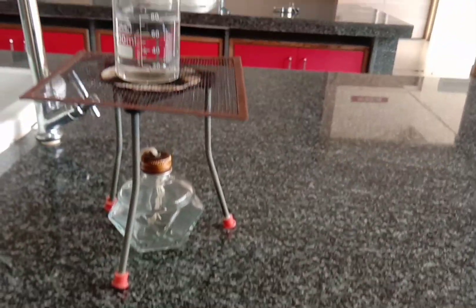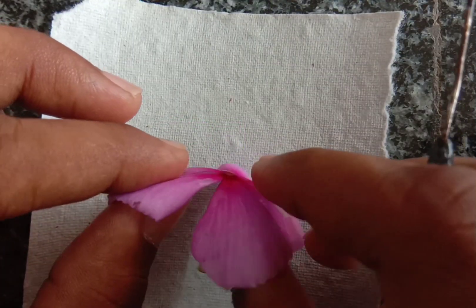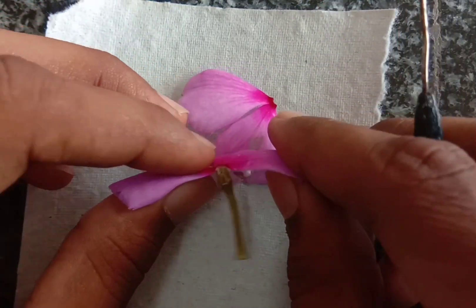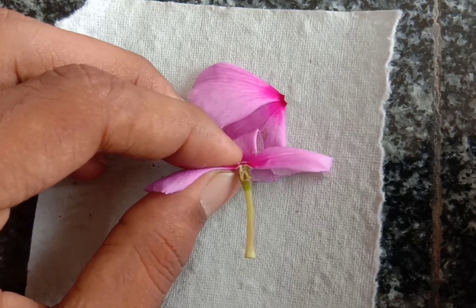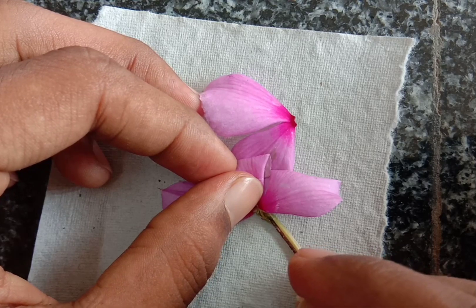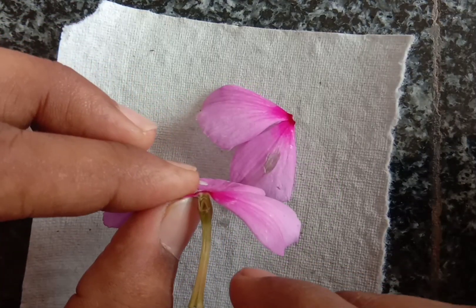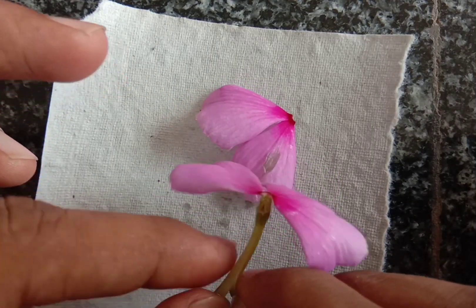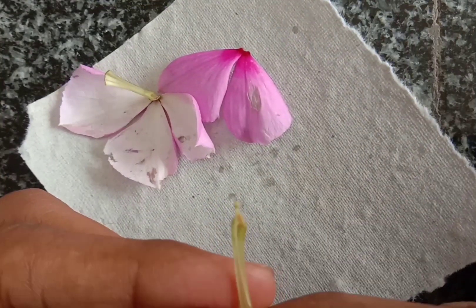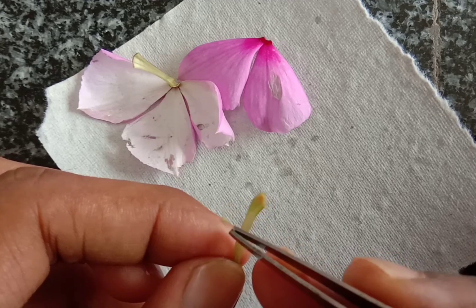Spirit lamp and a beaker with water. Procedure: take a Vinca rosea flower and make a small incision on that flower to take the pistil from it. With the help of a needle, make an incision and remove the pistil or carpel from that. You can see the pistil here — with the help of forcep, take that pistil.